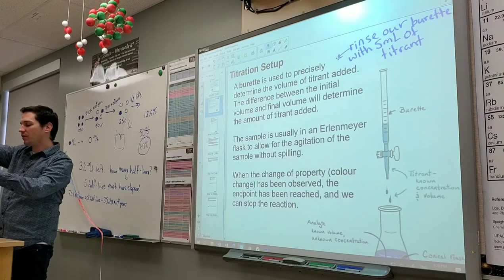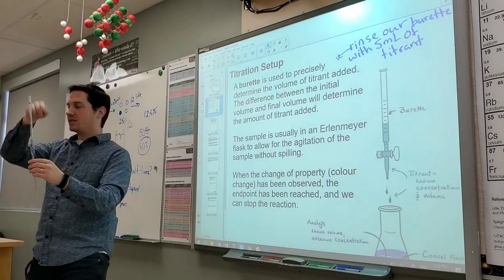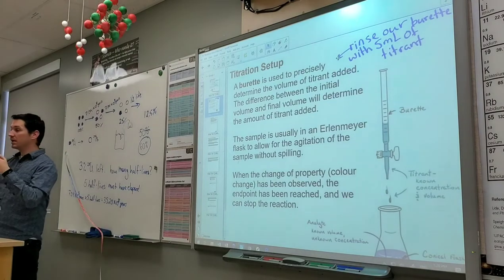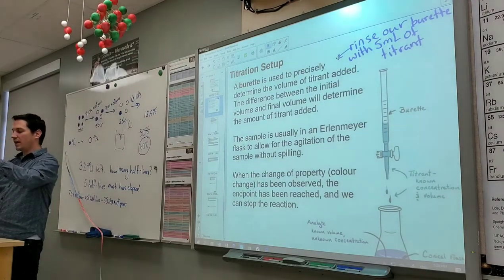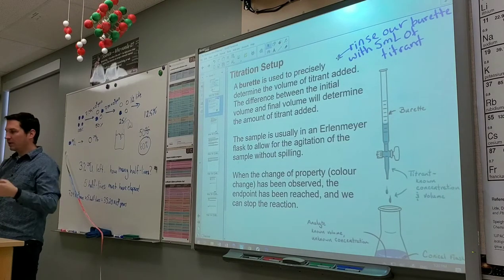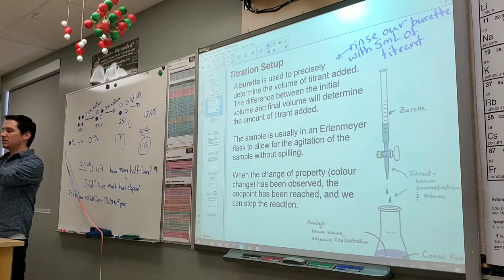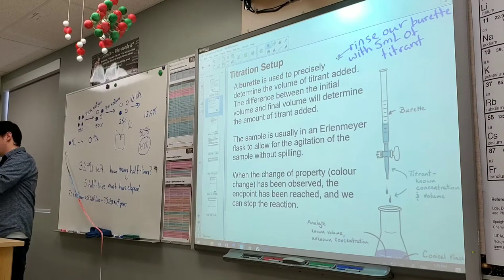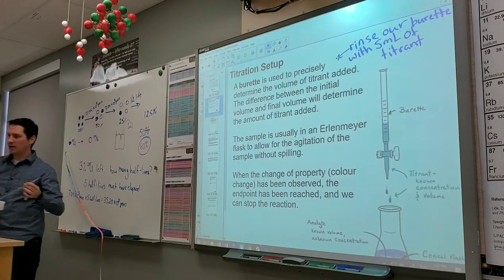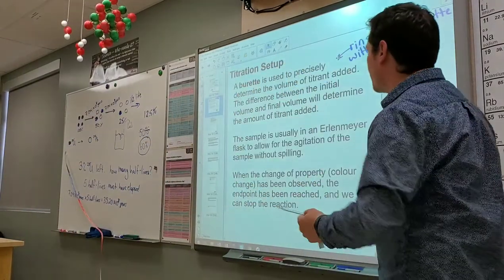It's the same thing with our pipette. Do you know the last thing that somebody used in this pipette? No. So realistically, what I should have done at the beginning of my experiment is pull up a little bit of sample and coat the walls with it, and then you can just dump it out into a waste beaker. Does that make sense? That's what we should be doing, and that's the expectation that I'm giving you from now on.